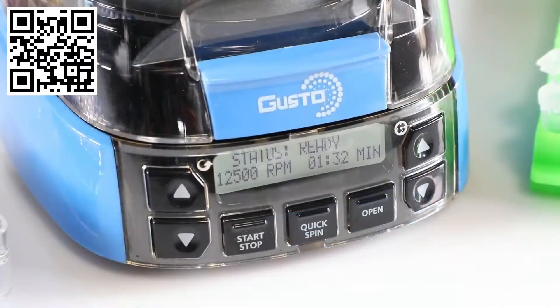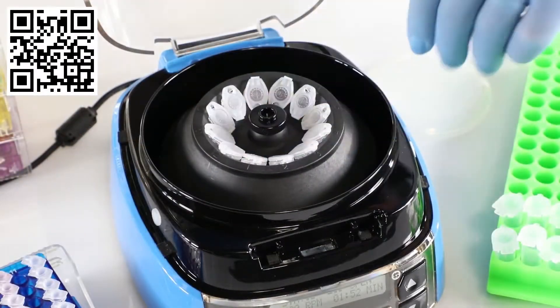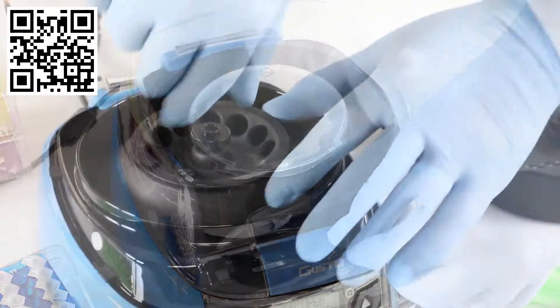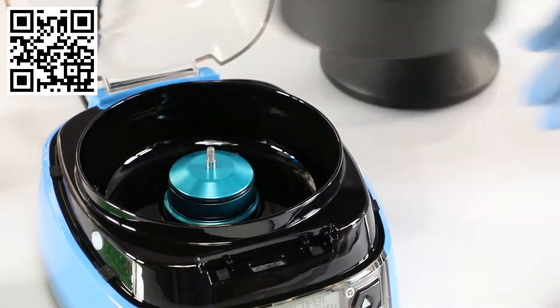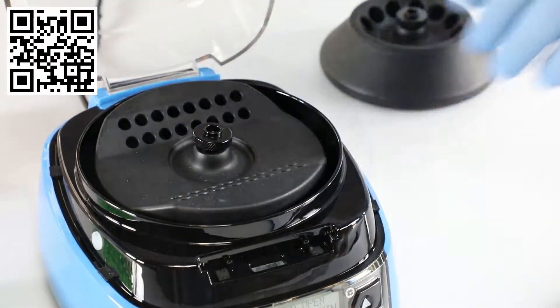This mini centrifuge performs fast spins up to 12,500 rpm and 9,800 RCF. You'll find the Gusto high-speed mini centrifuge is as functional as it is fast. Its comfort and ease of use enables quick, tool-free rotor exchange.